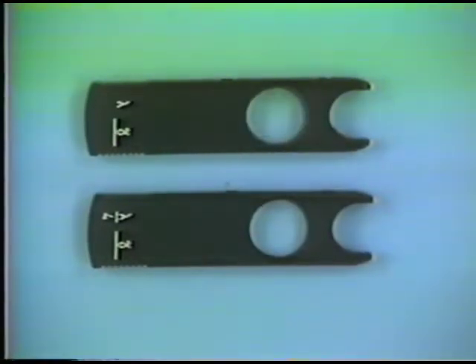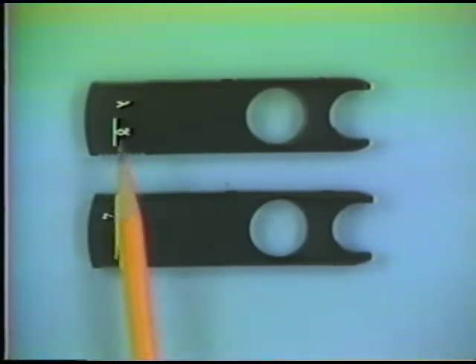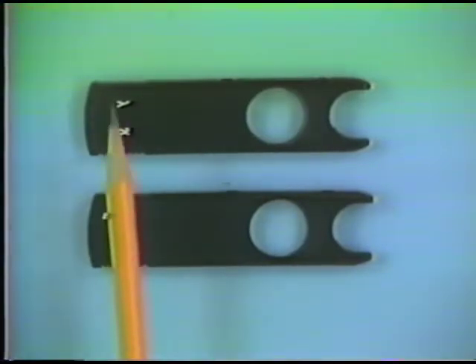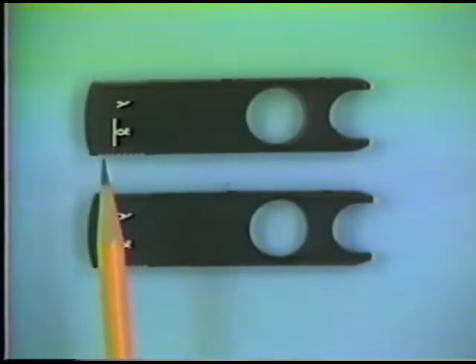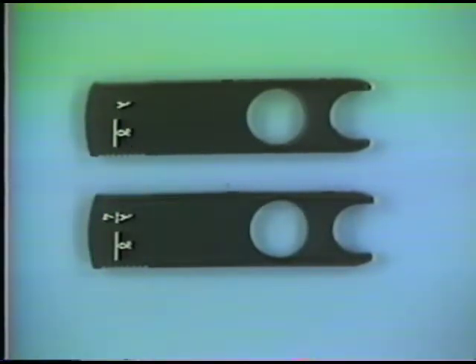You should be aware of what your accessory plates say. More conventional way is to put the slow direction across the plate like this, and this is what these two plates show. They have their slow direction, or the line of orientation that's located on them, going across the accessory plate, and this is something you want to notice.